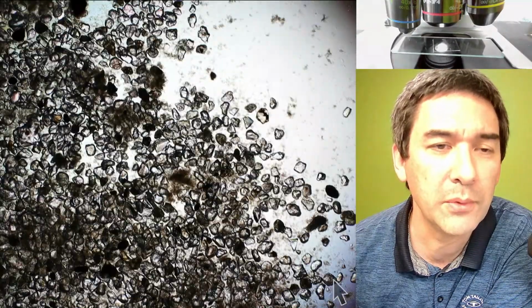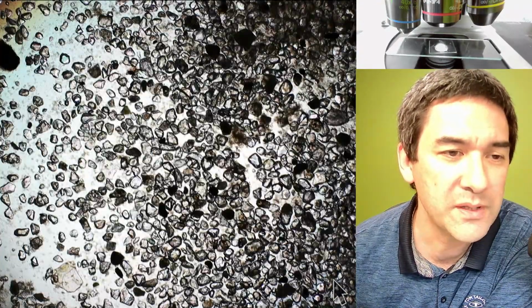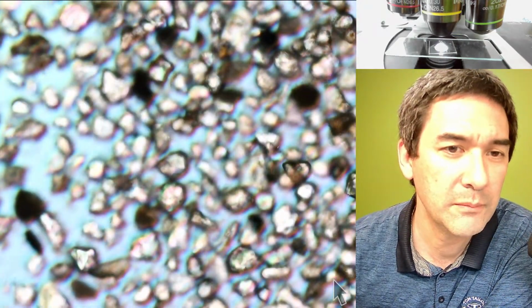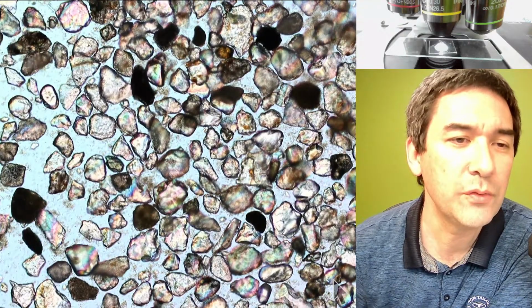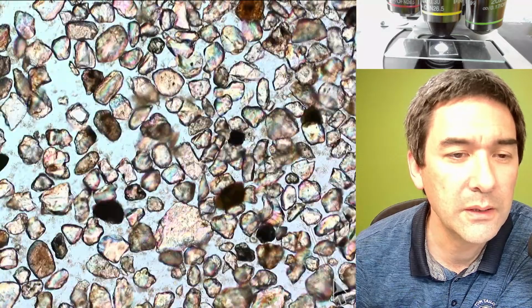I remember that at least 1.5 years ago, there was still quite a bit of movement in here. So I go up with the magnification. Sand grains actually also look quite nice. And it looks pretty dead.